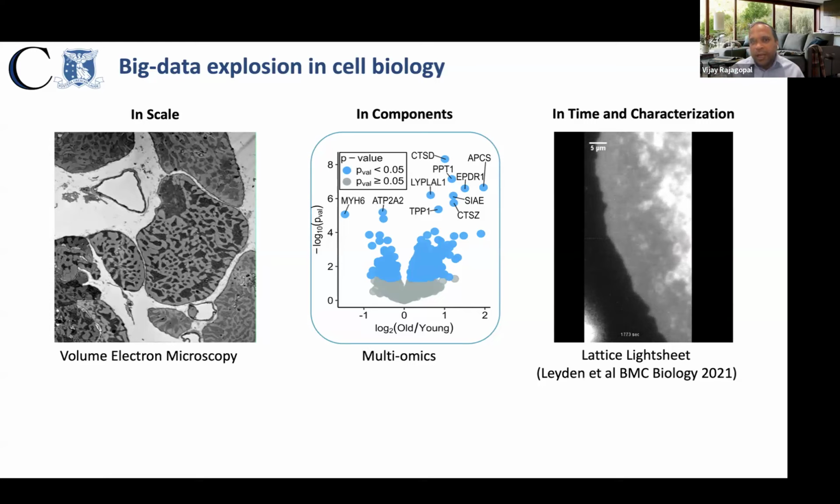You don't only get to see how the cell divides, you can also see how the whole embryo or the whole organ grows on an experimental platform. And you can image these things for hours. So you can get lots of data. The excitement is that you have lots of data, but the problem is that we need to be able to analyze them if we're going to make some discoveries.